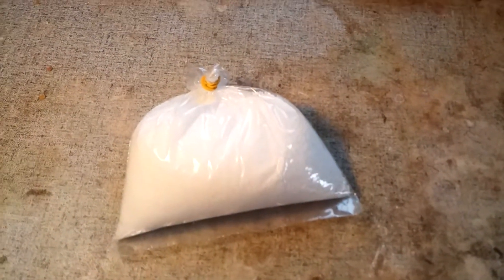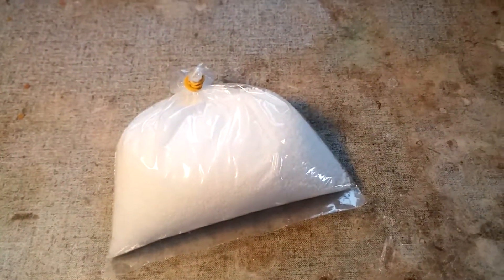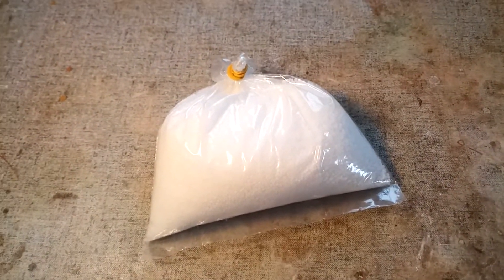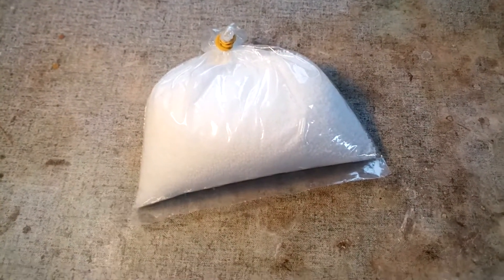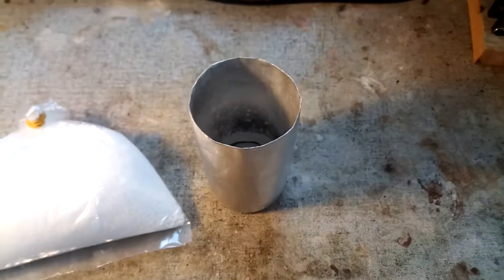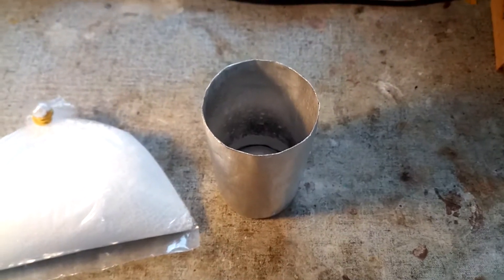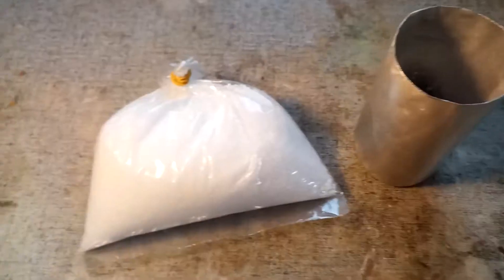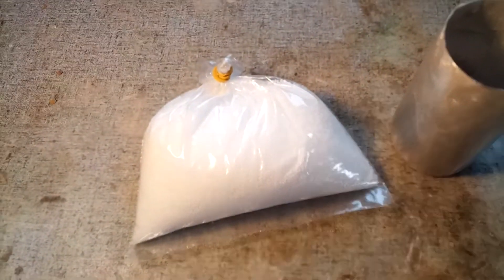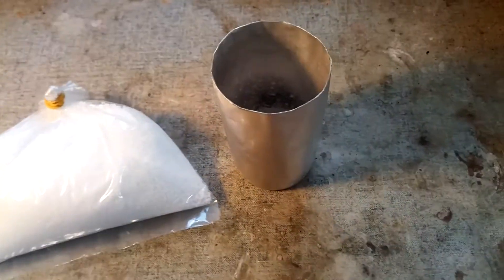Biuret is easily prepared by just heating some urea — I've got a bunch of it here — to somewhere between 130 and 150 degrees Celsius for a few hours. I'm going to be doing the reaction inside this aluminium can because I've already broken way too much glassware doing things like that. I'm just going to measure out about 200 grams of urea and get this heating.